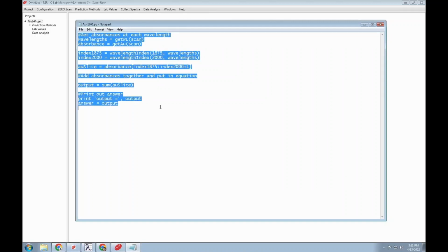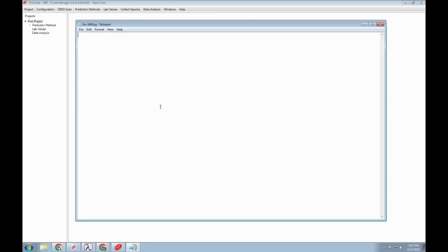So I'm basically going to start over, so I'm going to delete all this. Our script is going to be something very simple. We're going to say answer equals get absorbance at scan 1600.